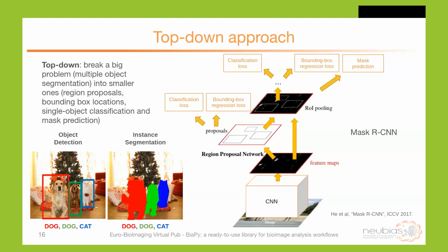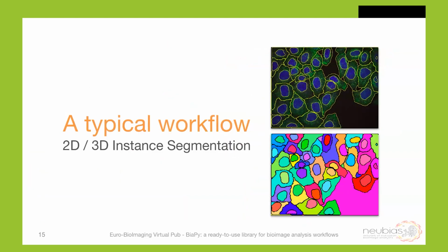I just want to know if all the models are based on existing pre-trained models like StarDist 3D or CellPose, like you stated earlier, and also if we always need masks to use BiaPy. You always use masks, labels, I mean.